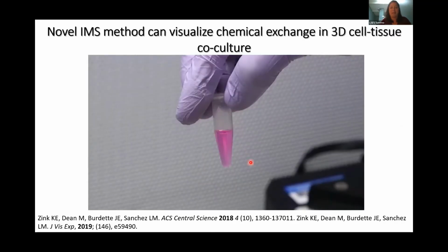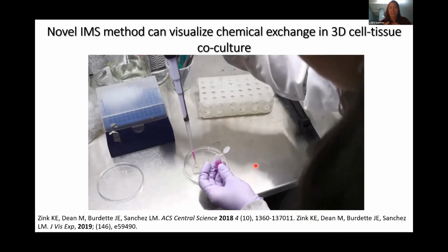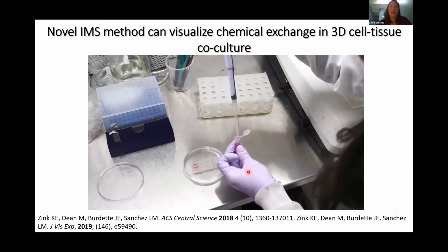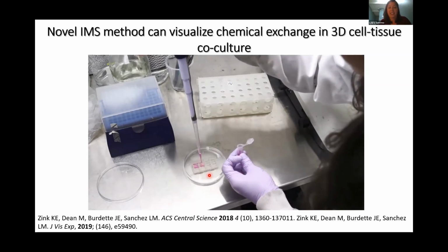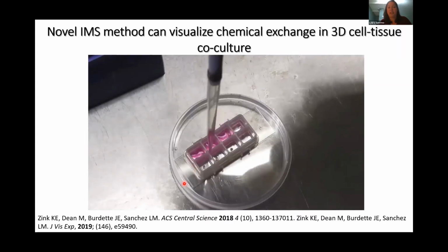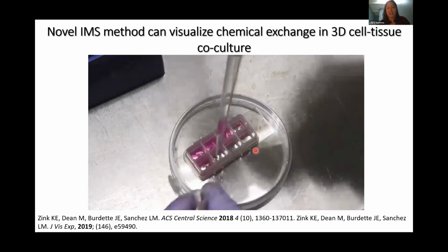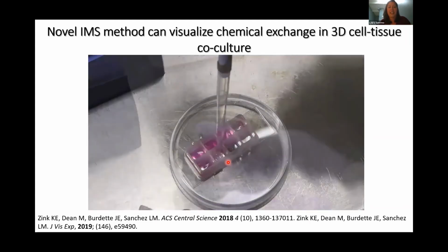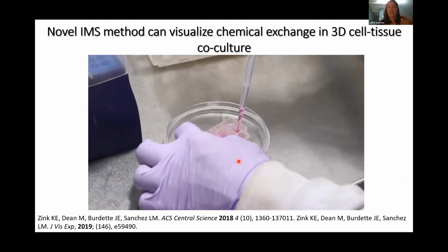So now a movie may or may not play. Maybe I'll click start one more time. There it goes. And what you're actually looking at is how we've adapted what we knew about the microbial imaging to this system. So this is Catherine pouring in 1% agarose with about 50,000 cells into an 8-well chamber. So what you can see here is we've repurposed this 8-well chamber. It's now adhered to an ITO glass slide. And the little seed-looking thing in the middle is actually the ovary.